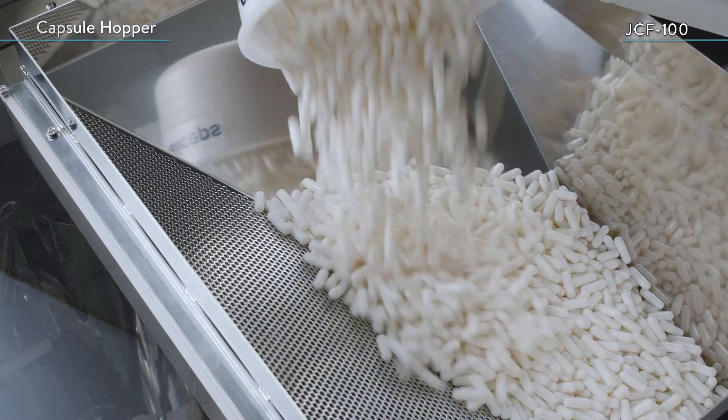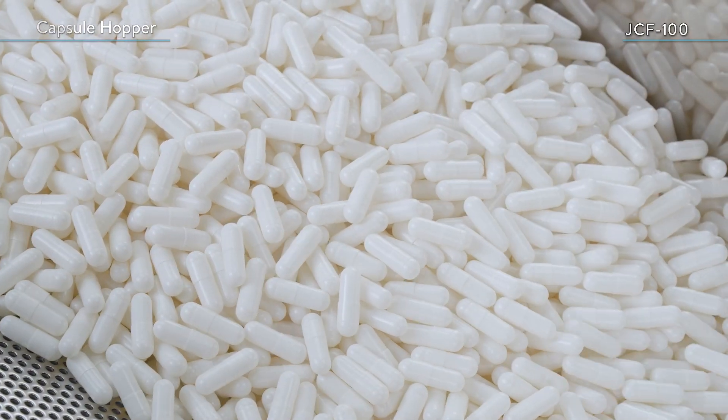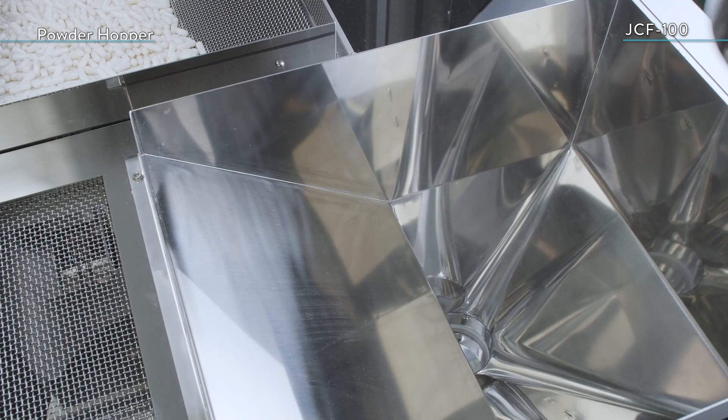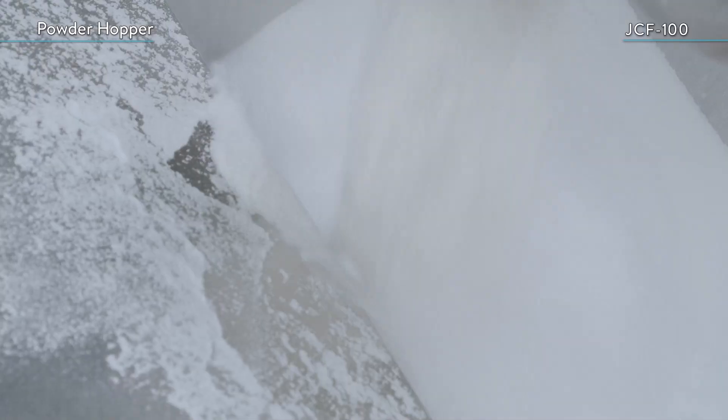Hard capsules are fed into the capsule hopper. Powdered medicine is fed into the powder hopper.